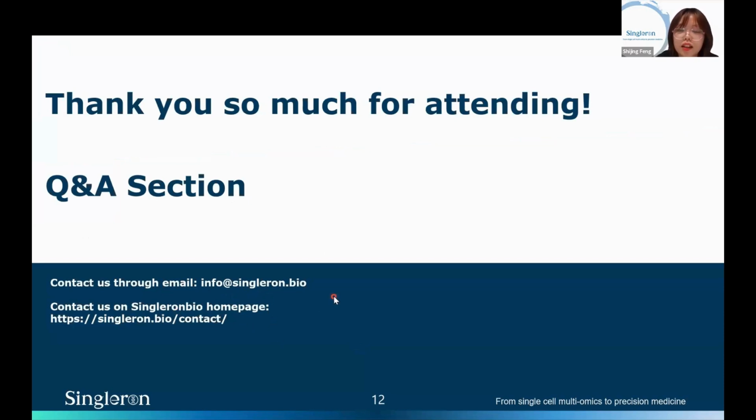And here comes the Q&A section. If I have multiple collections from the same patient at different time points, how can I achieve SNP-based sample multiplexing?